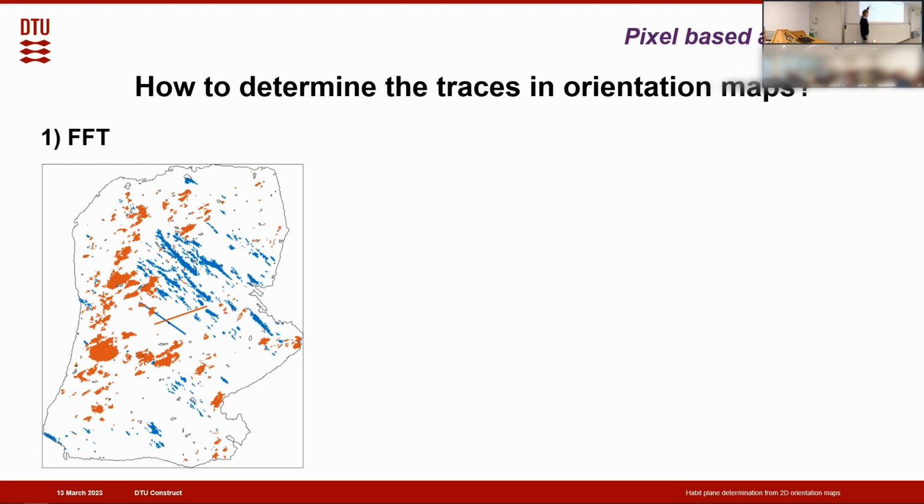So this is one prior austenite grain, one parent grain, and we have 24 different martensitic variants possibly in this grain, and we try to highlight them individually. So this is one martensitic variant, and the orange one is also a martensitic variant. We can see that there's some kind of directionality to the microstructure, and that actually reflects the habit plane, which is parallel to the long edge of these grains.